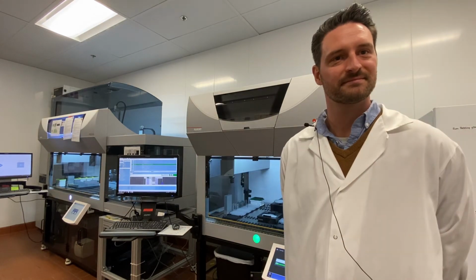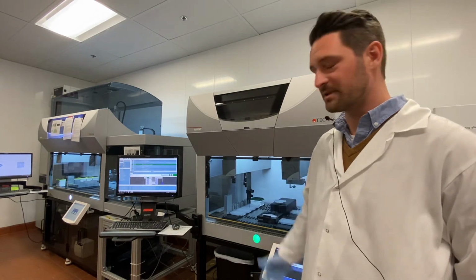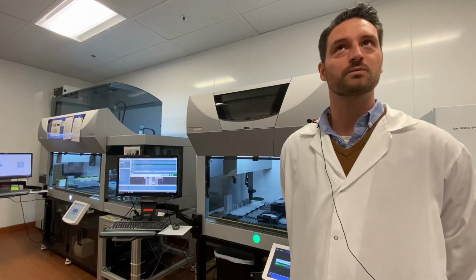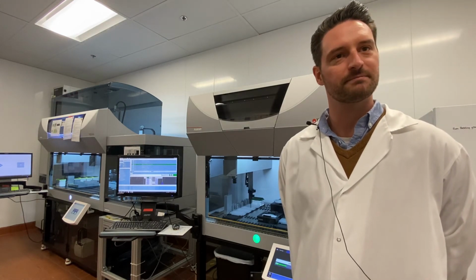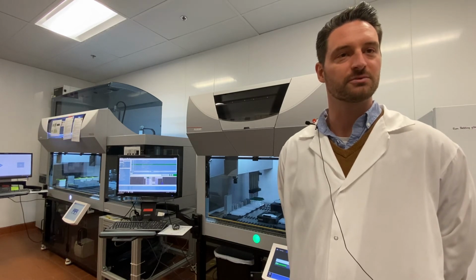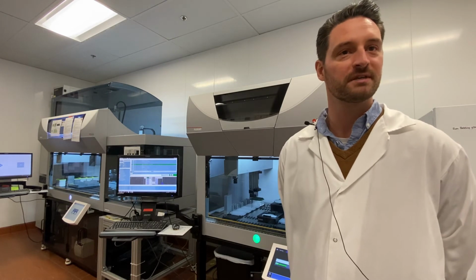What are some of the benefits that you're seeing using robotics? With our robotics platforms, in particular the platform that you see behind me here, it really helps speed up a lot of our more precision pipetting processes. Normally what would take 15 minutes for an individual at the bench to do, this robot could accomplish for us in about 5 to 7 minutes.